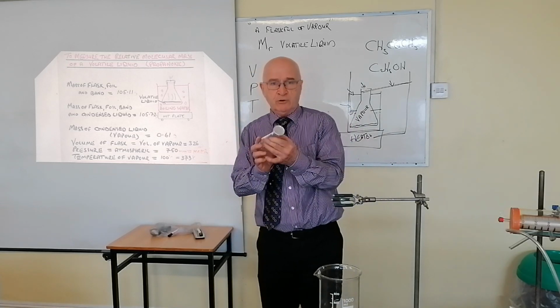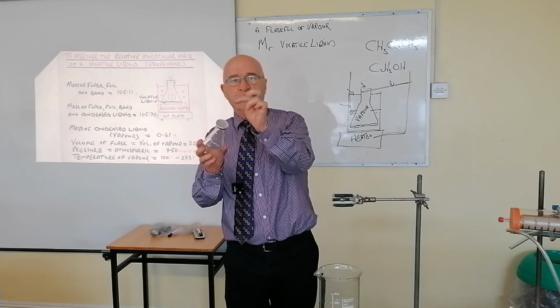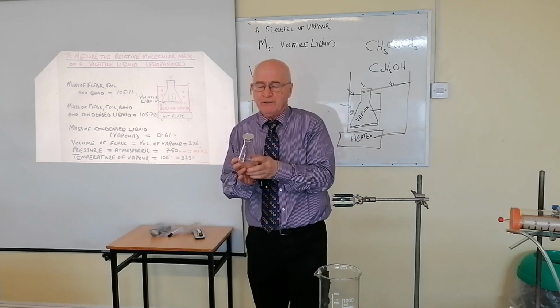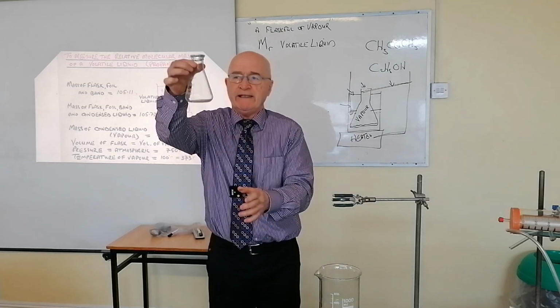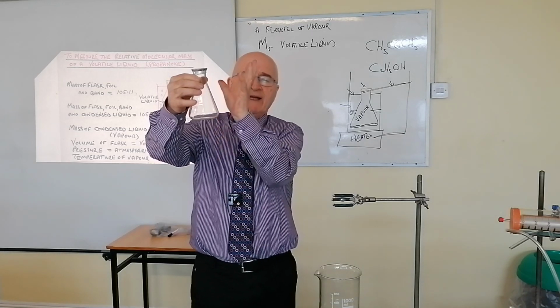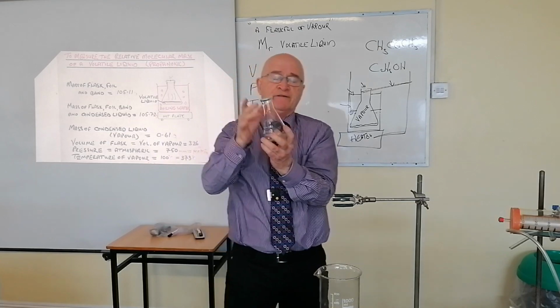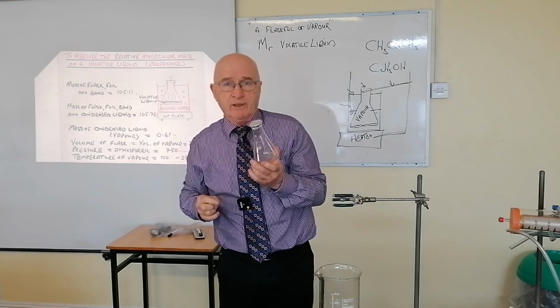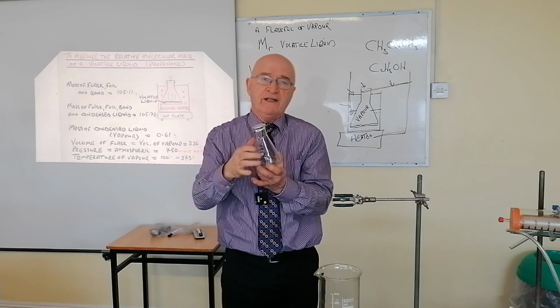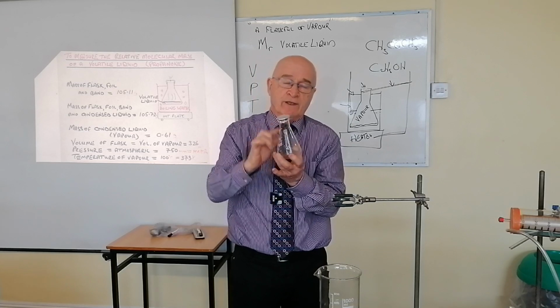What is the purpose of the pinhole? The purpose of the pinhole is to ensure that the pressure inside is the same as the pressure outside. Let me just say what would happen if there was no pinhole there. If you started to heat the volatile liquid in boiling water, it would vaporize, there would be a gas in there, the vapor, and it would blow the lid off the top of this flask, just like with the champagne bottle. It would go pop, and you don't want that happening. So the pinhole prevents that. It equalizes the pressure inside and outside. And that's very important.